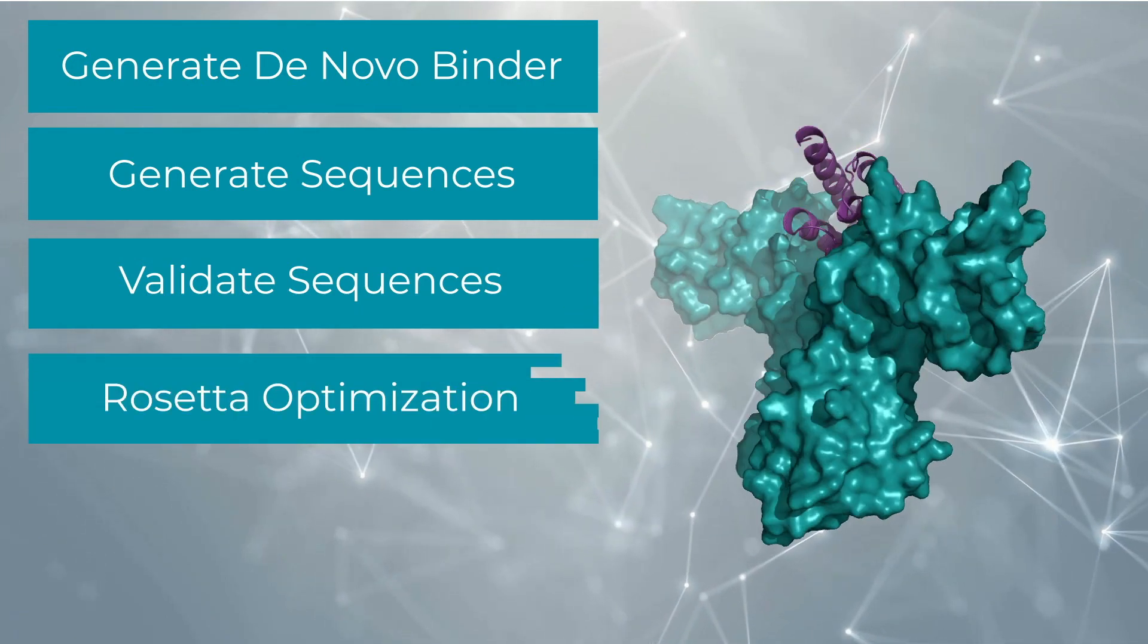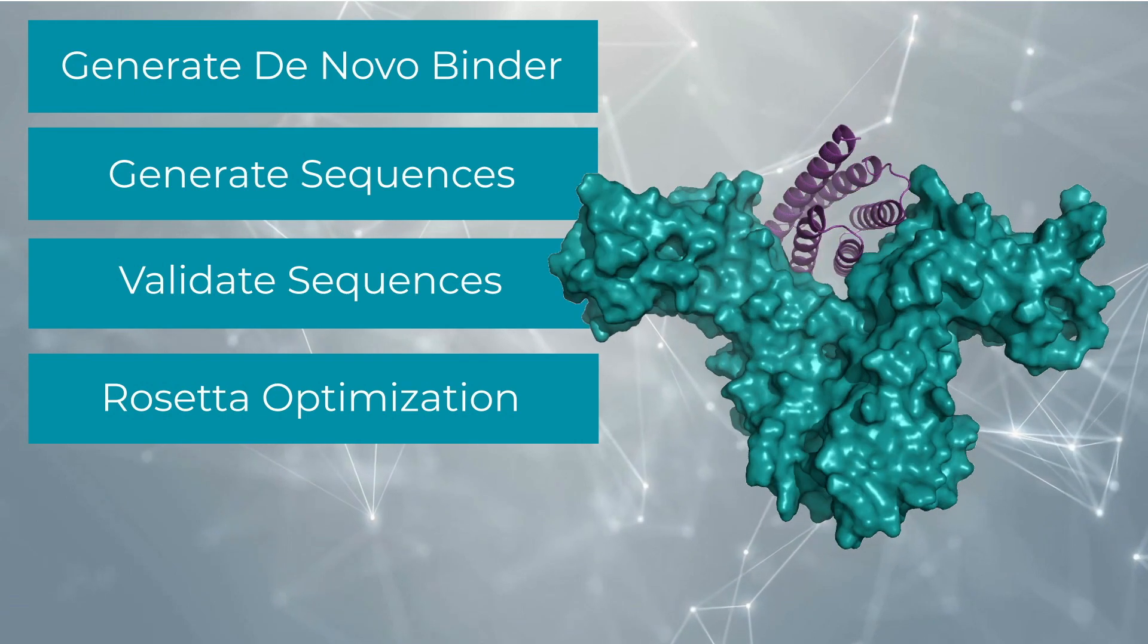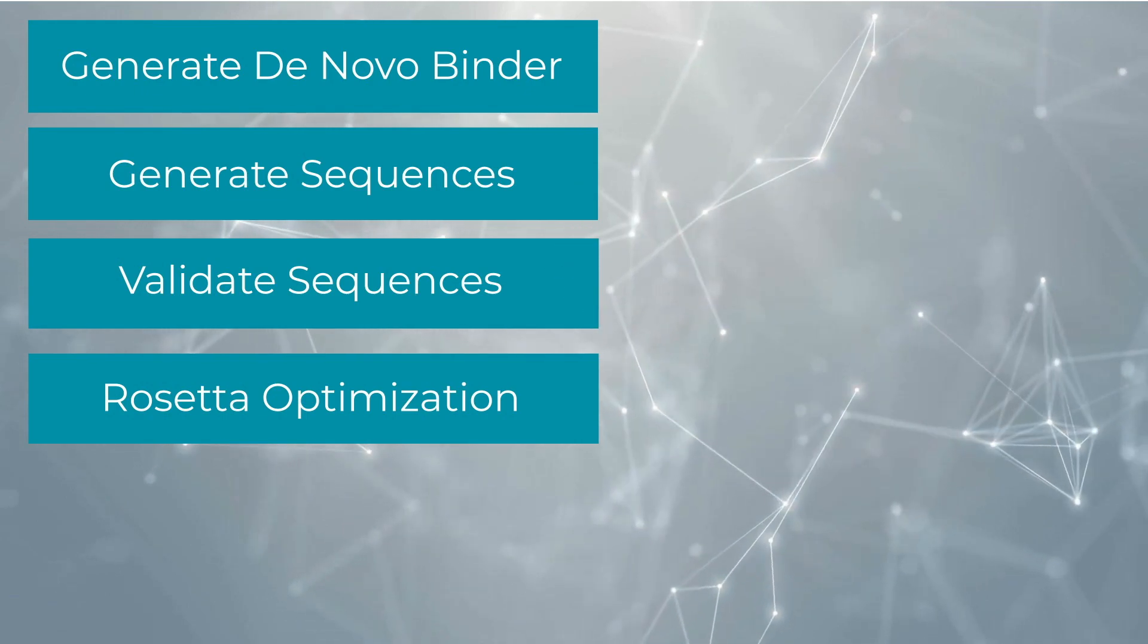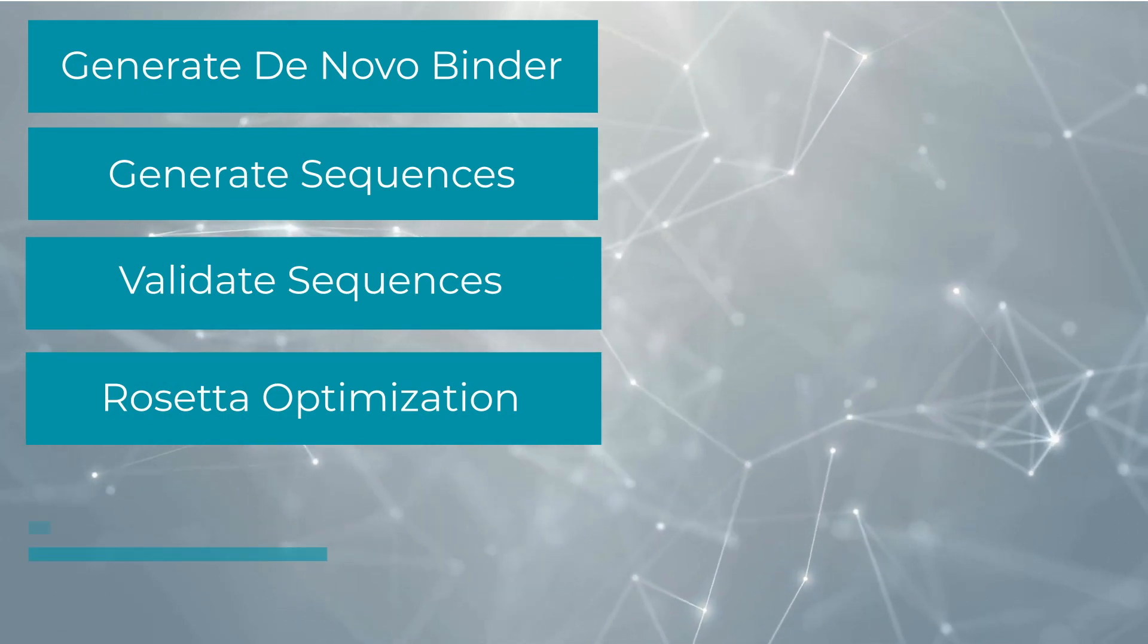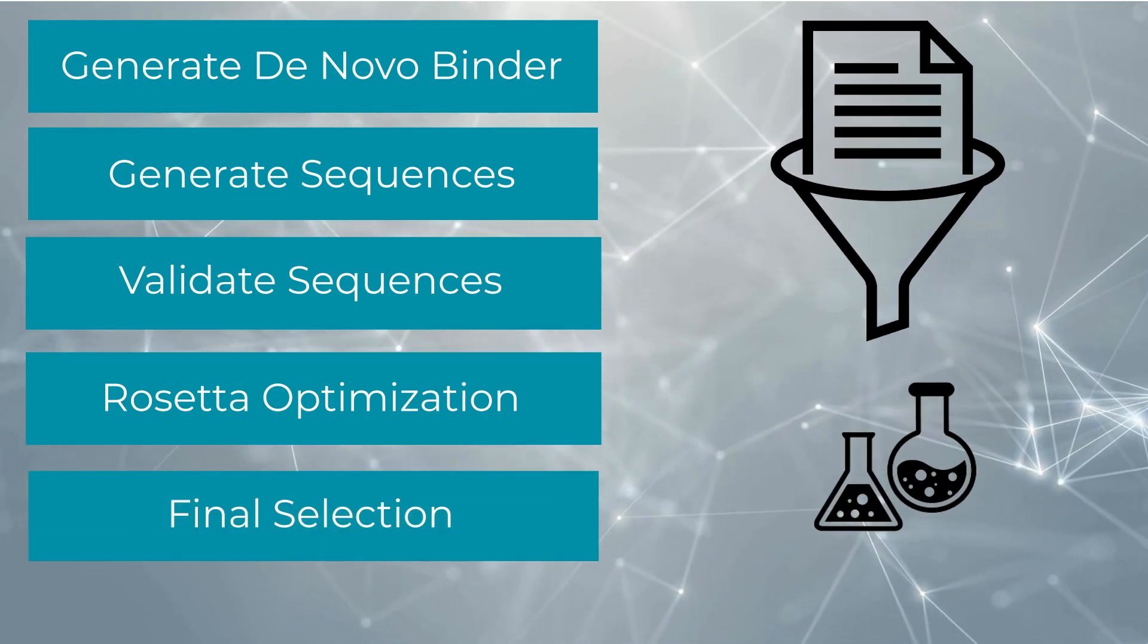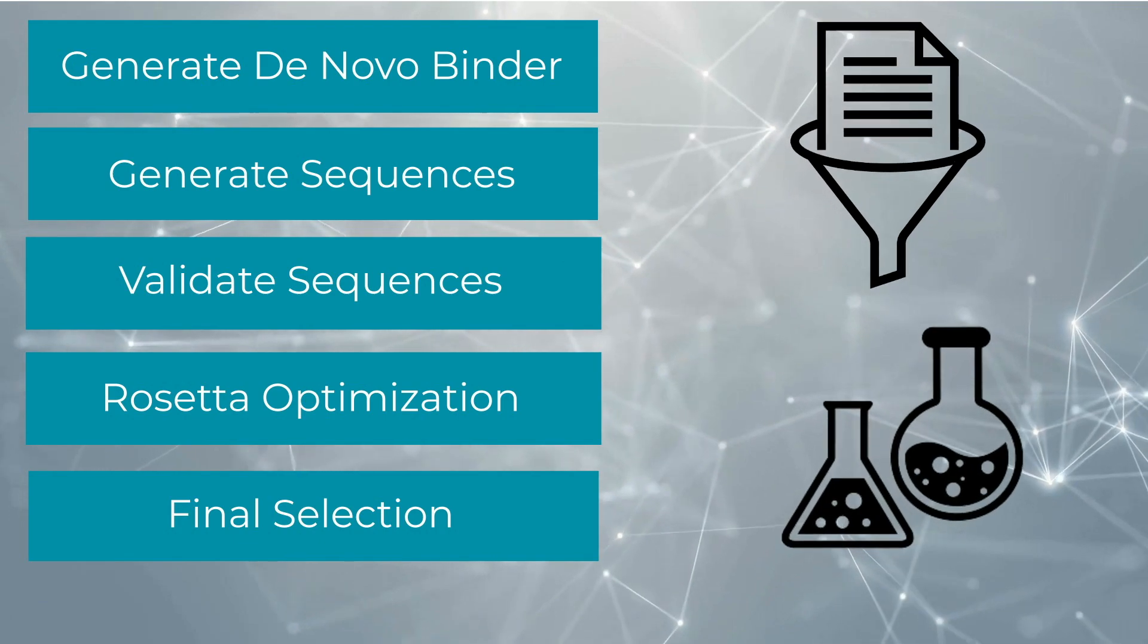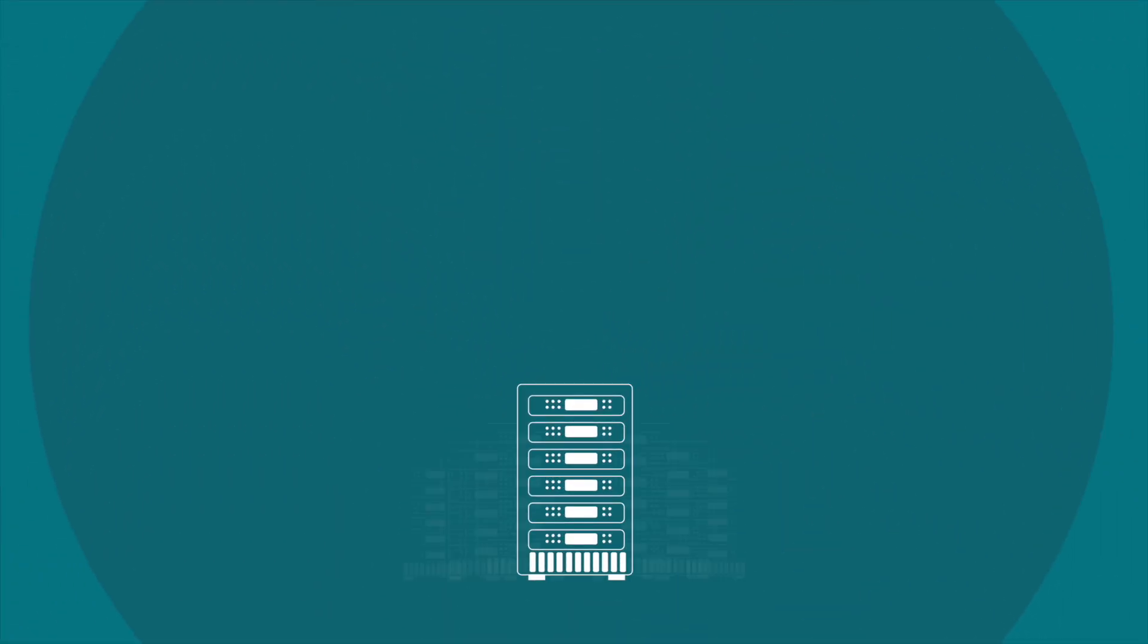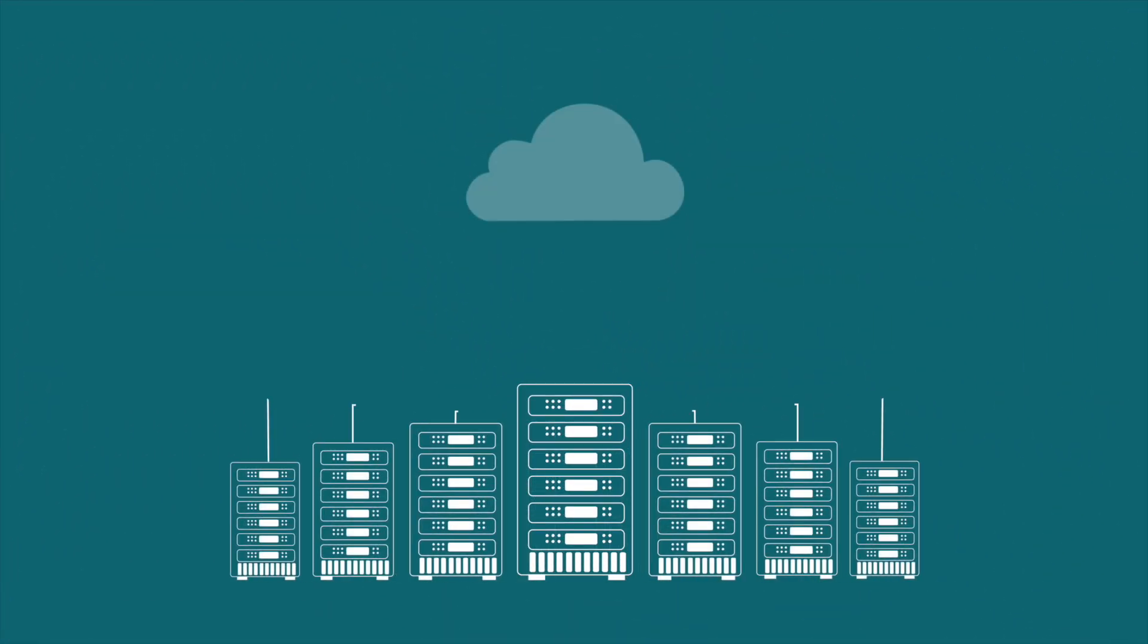Optimize the monomer and bound confirmations with Rosetta Relax. And finally, choose the designs worth testing in the wet lab by comparing Rosetta energies.